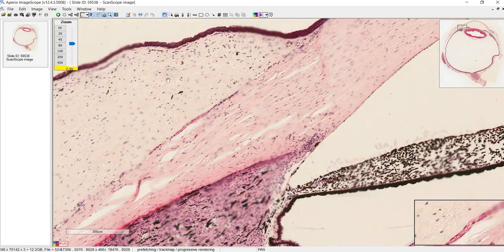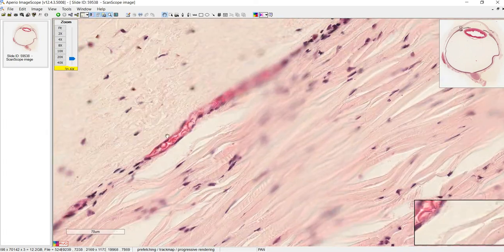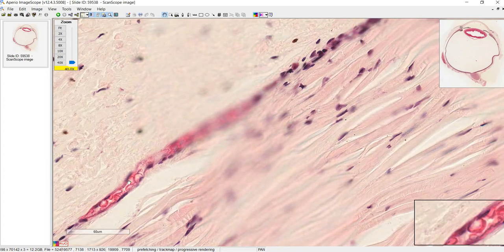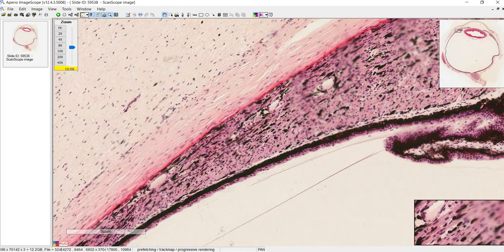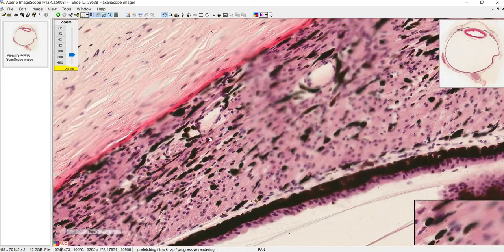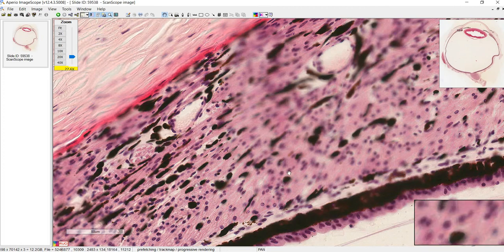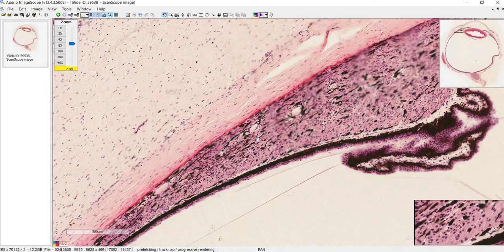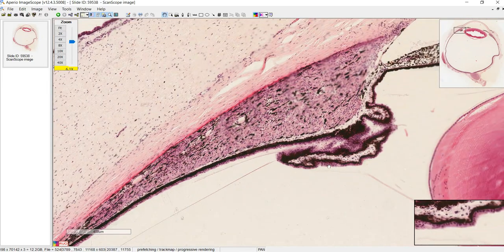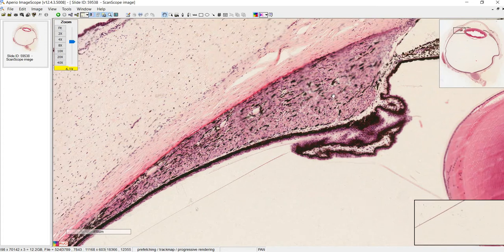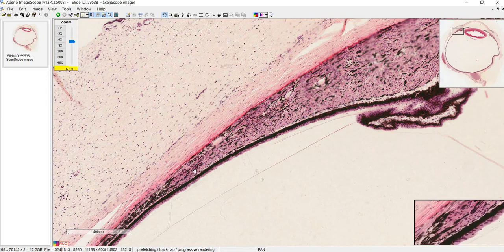The sclera is also mostly avascular. There is a layer between the conjunctiva and the sclera called the episclera — that's probably right here where you can see some blood. The ciliary body, like anywhere that has muscle, does have its own vascular supply as you can see here. Now moving toward the posterior portion of the eye: I mentioned the pars placata, which is what generates aqueous humor through its epithelial cells.